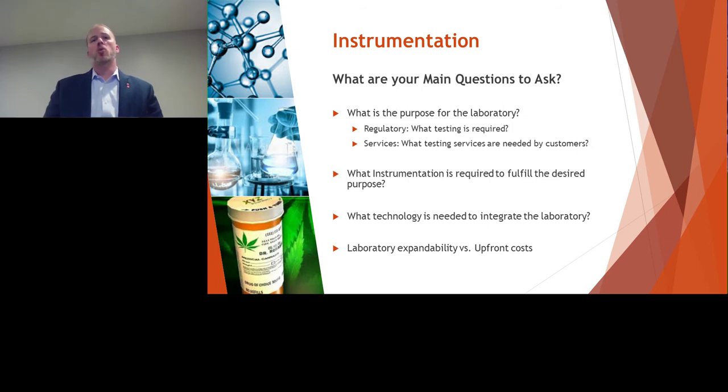So you know what your standard tests are. You know what particular requirements are there. If you're looking at cannabinoids, what cannabinoids? If you're looking at heavy metals, what are those heavy metals? You have specific lists that are required.